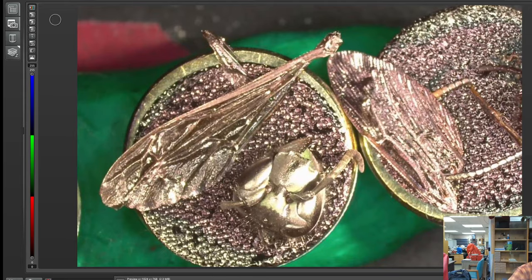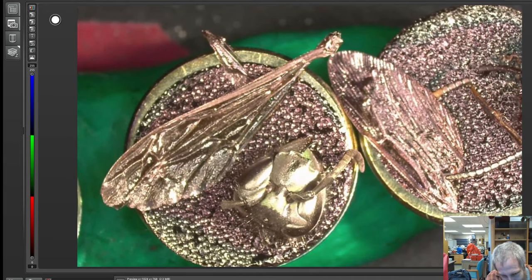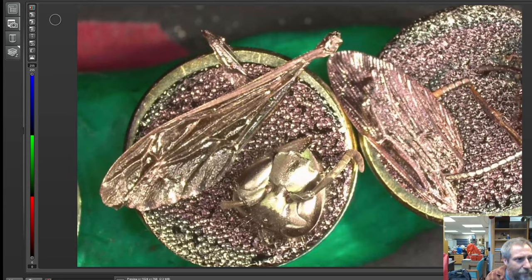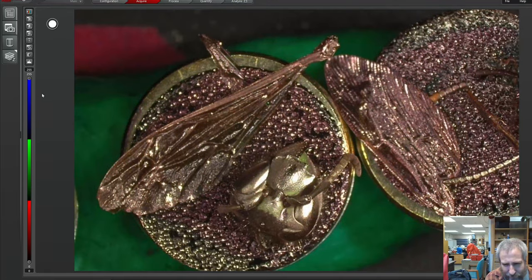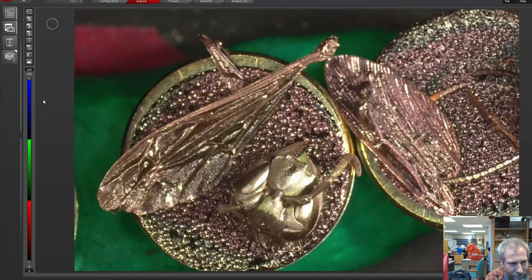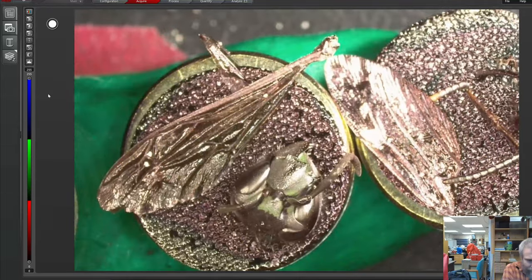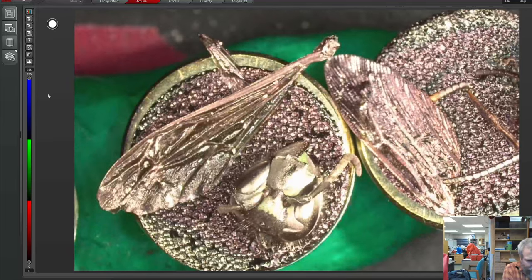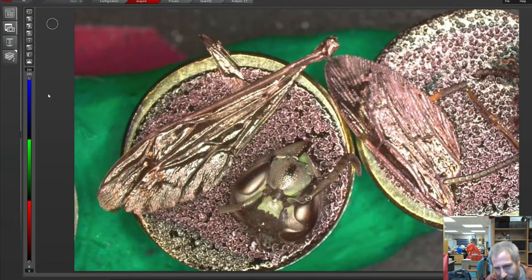And let me get this into focus for us. Looks pretty good in there, but it doesn't look quite as good on the camera. Maybe I'm over-brightened a bit. Hang on. Let's see if I can fix this, brightness down. I can do it kind of manually if I use these off completely, and we could just use the ring light. Then we don't get so much of the glare.